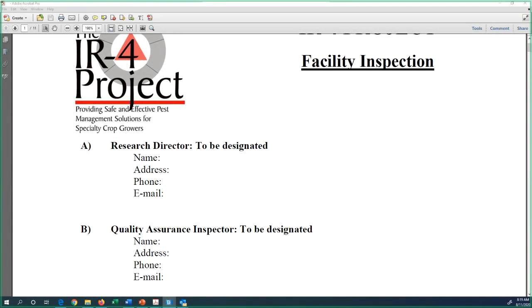We got approval from EPA and also got the green light from the registrant. The company said yes, this is a good way to go to minimize the matrix effect. For some methods which the company used many times and worked very well, they will give you the red stop sign: no, just use solvent standards.